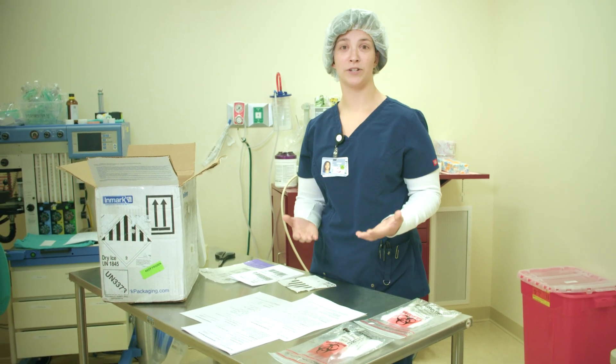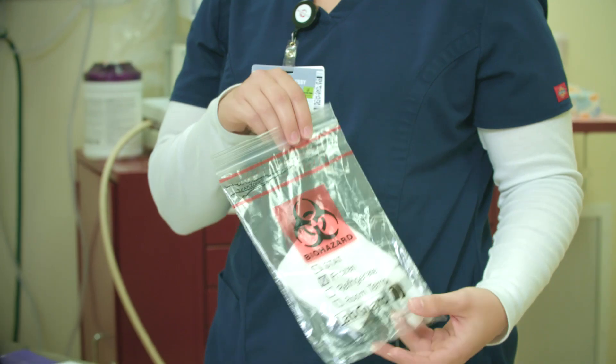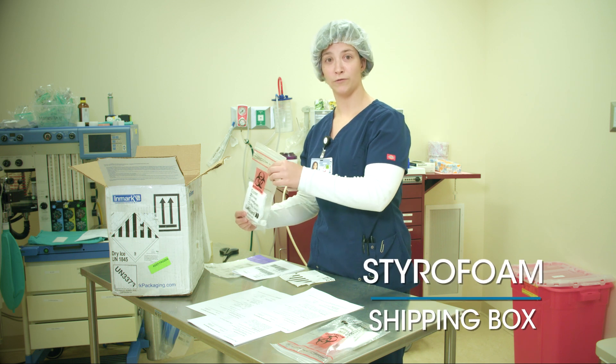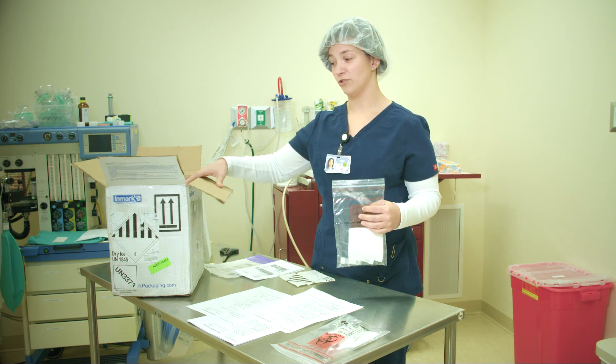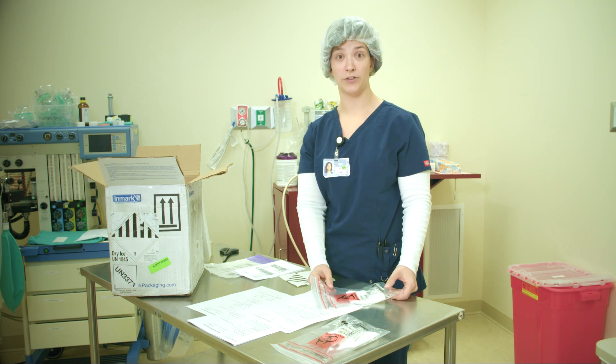When it comes to shipping your sample to the lab, one of the most important things is that you recognize that the sample cannot be thawed once it's frozen. You may be grabbing the sample from wet ice and then placing it in the styrofoam shipping box where it will freeze, or you could be grabbing the sample from a freezer. If you're grabbing it from the freezer, make sure that your dry ice is ready to go because you do not want it sitting on a table to thaw.